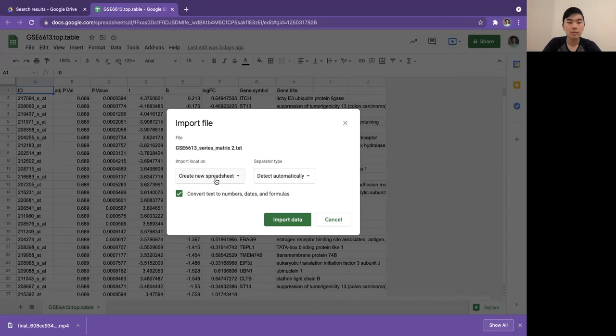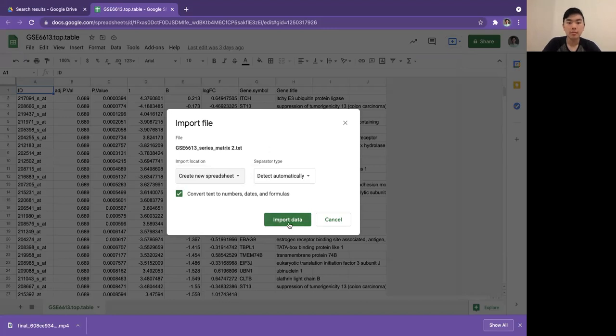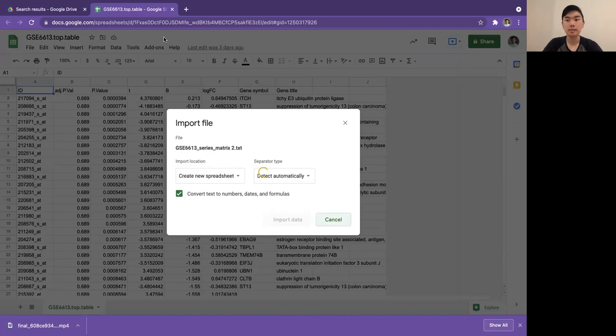I'll create a new spreadsheet and leave everything else the same. It should be able to detect the formatting automatically. Let's just give it a few seconds. The bigger your file, the longer it takes.